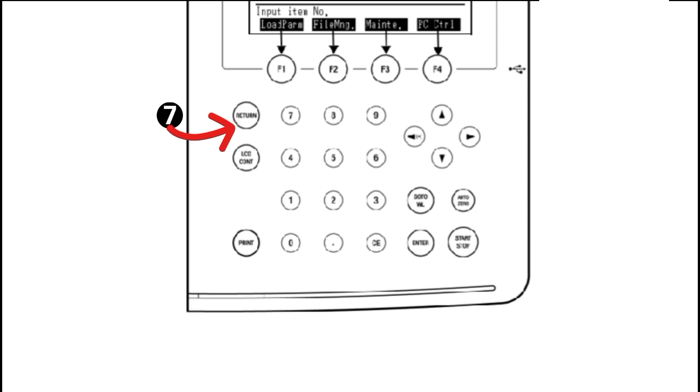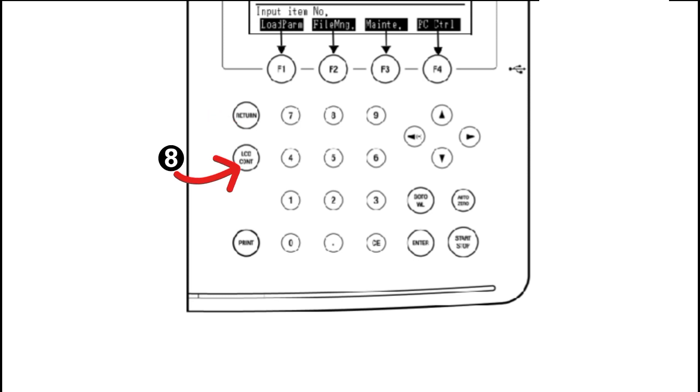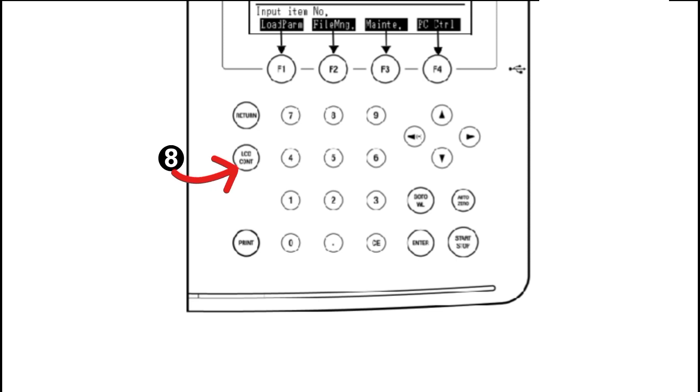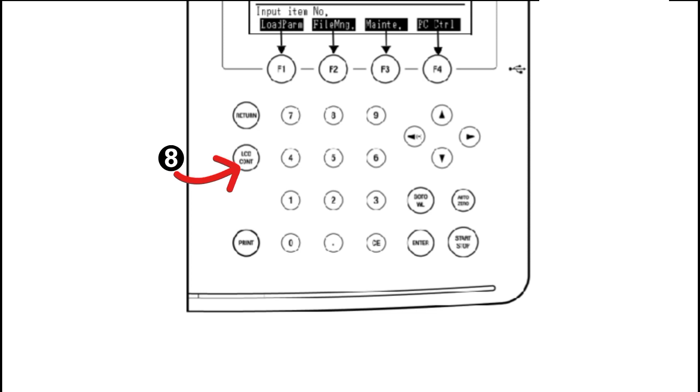Number eight is the LCD contrast key, used for the adjustment of screen contrast. When we press the upward or the downward cursor key, we can see the change in the contrast of the LCD screen after pressing that key.